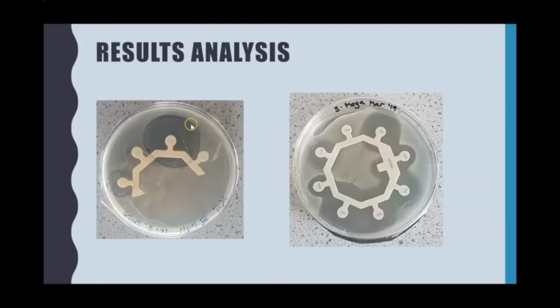Now, to make that easier, I suggest drawing around in a permanent marker. If you've not done that already, maybe have your picture up and then create a circle shape on the computer and put that around it to see if that helps. So you need to know the diameter of your inhibition zones. I've included this one here as well because you can see it much clearer than on my one. So you can really see on this one clear inhibition zones.